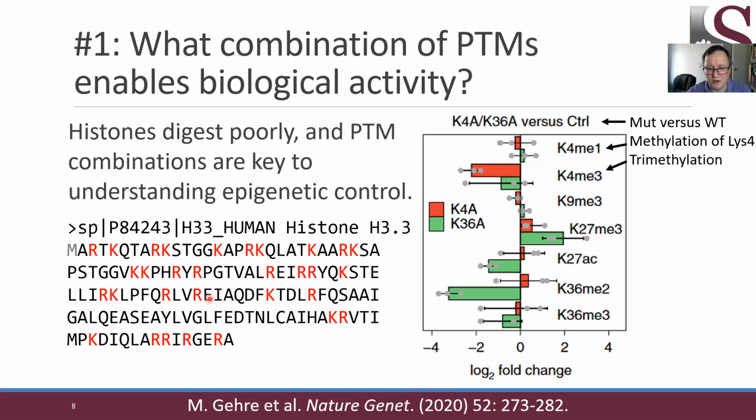I mean, look, this is 1, 2, 3, 4, 5, 6, 7, and that's one of the longer peptides, plus this really long one starting with F, Q, S, A, I, etc., down to this KR. So you get one long peptide and the rest of it is basically sliced down to tiny little slivers of peptide. Using trypsin on this guy is not a very good idea.